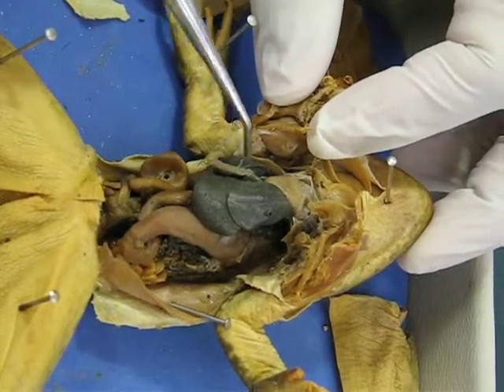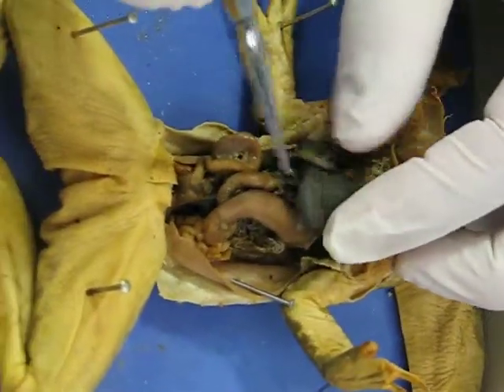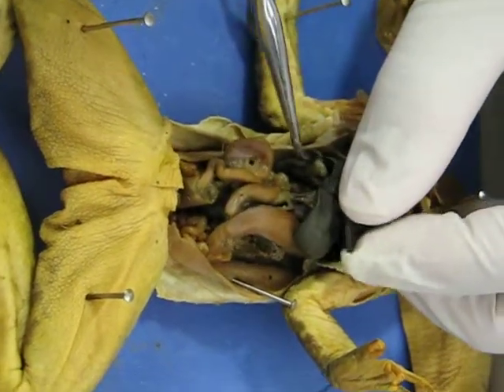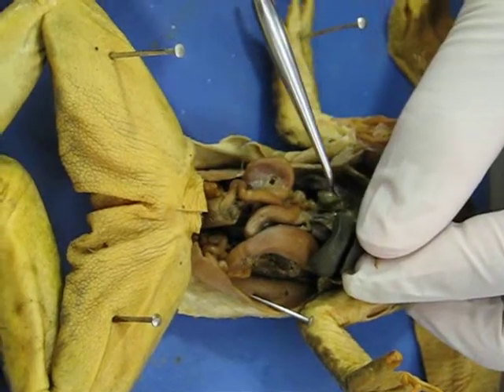These big lobes here are all liver. You pull the liver back, and you should see a little green ball. It looks like a deflated pea, and that is the gallbladder.